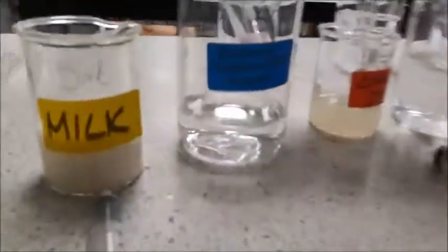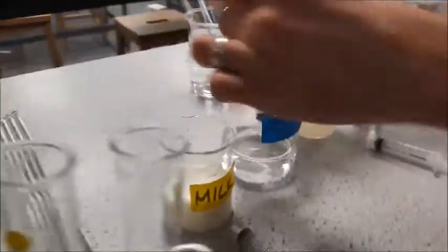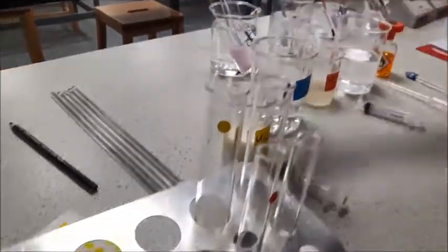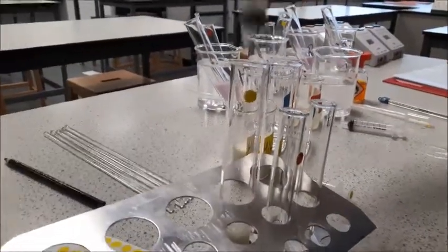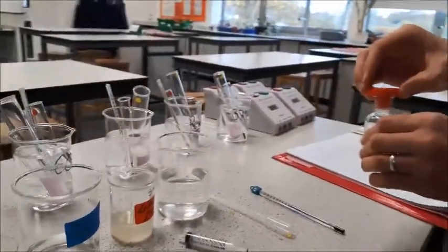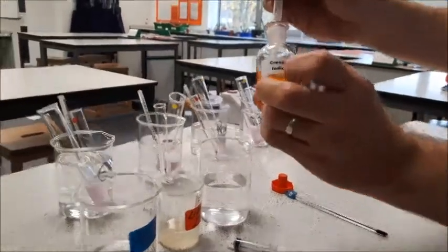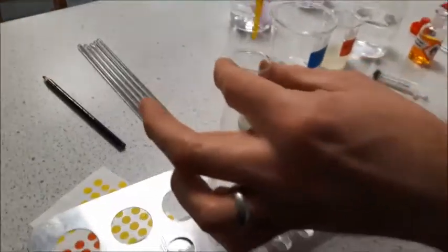The next chemical is 7ml of my sodium carbonate solution, and again that's going in with the milk. Then I need to add 5 drops of my Cressel Red, which is also going into the milk.